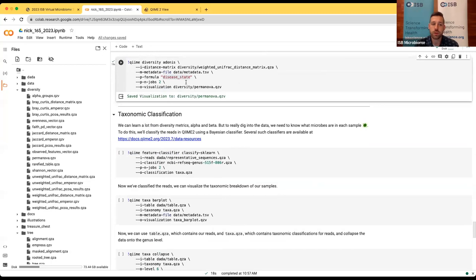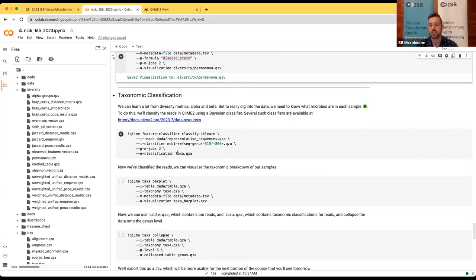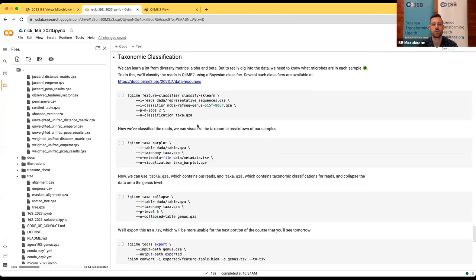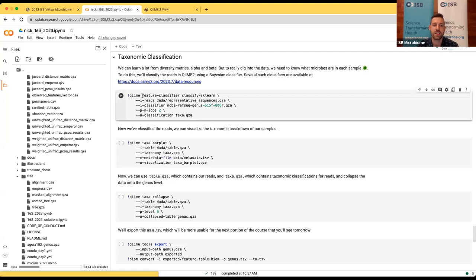Now let's switch back to the notebook and begin assigning taxonomy to each of our ASVs. Hopefully you still have the notebook open and connected. If your notebook has disconnected or you've lost data, don't hesitate to reach out to the TAs. As a reminder, any outputs we've already produced are available in the treasure chest directory within the materials folder, so if you need to restart you can always find the QIIME inputs there.